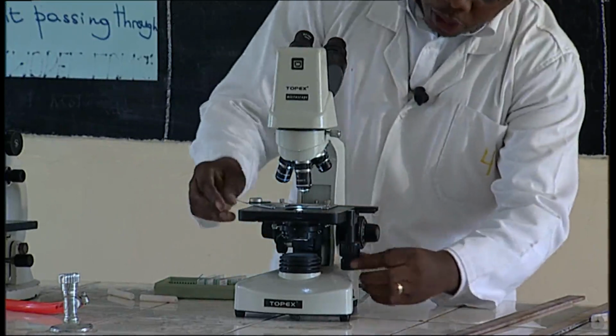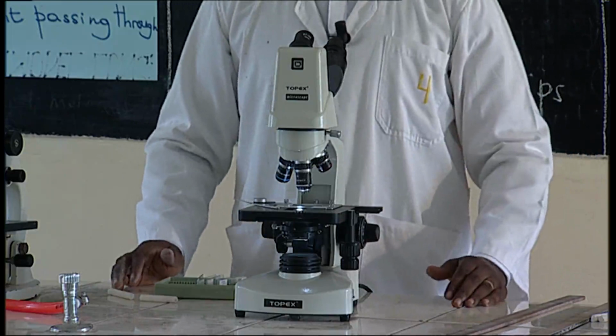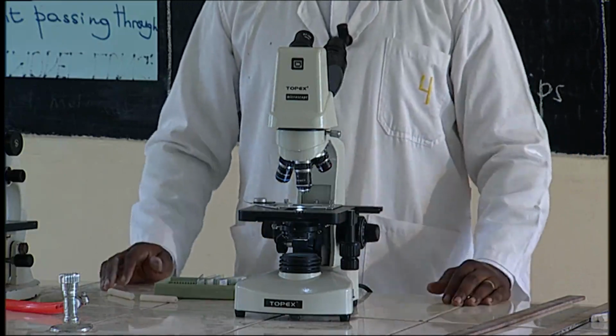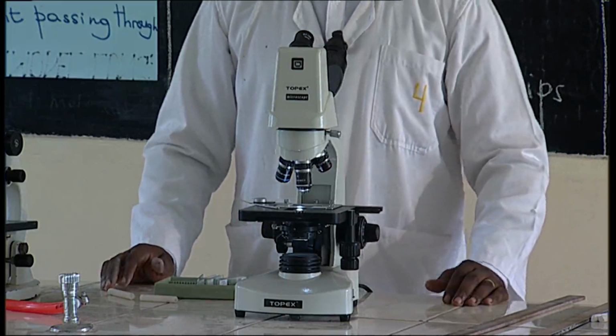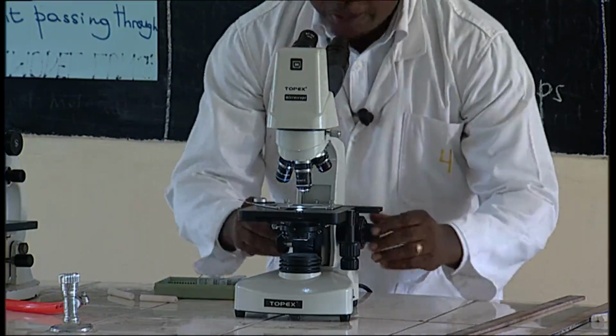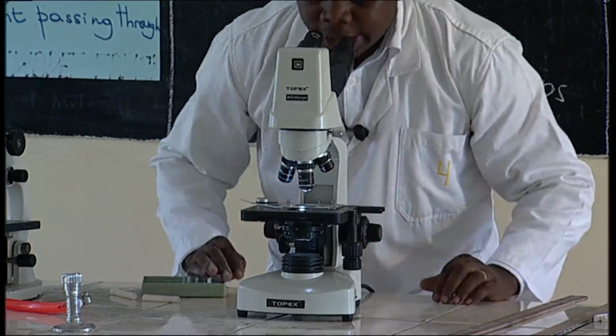And when I put it on top of the stage of the microscope, it is going to be supported by stage clips. The stage clips are going to hold it in position, and then from there, I can observe nicely my specimen.